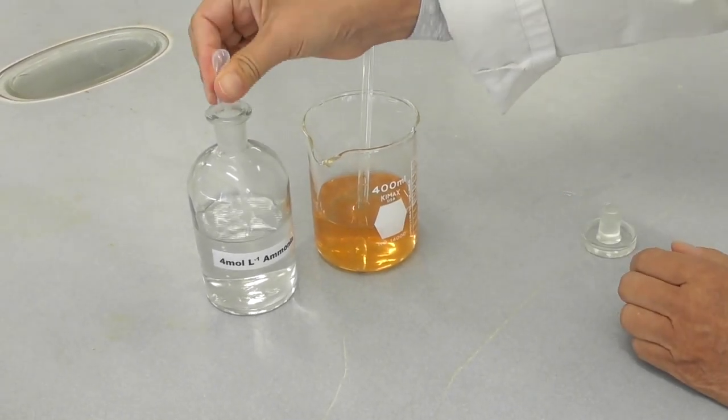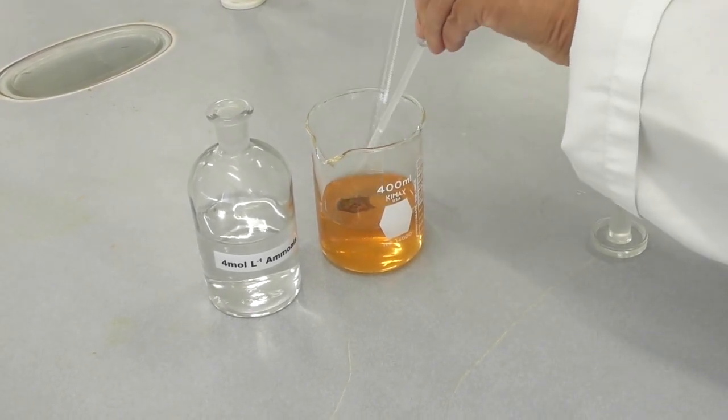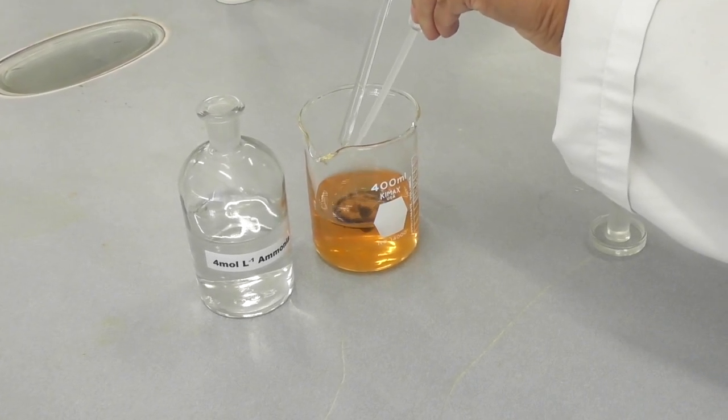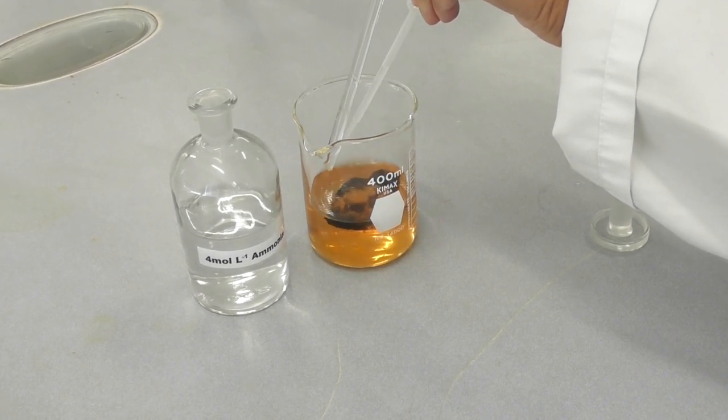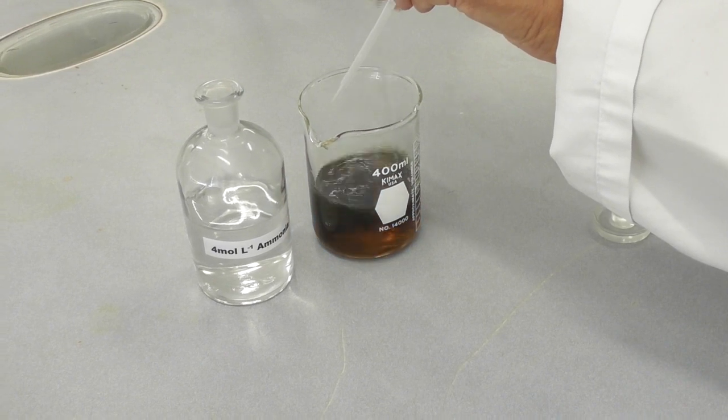Once everything is dissolved I start adding ammonia solution to my iron solution. As soon as I add ammonia, magnetite is formed, which you can see as black precipitate.